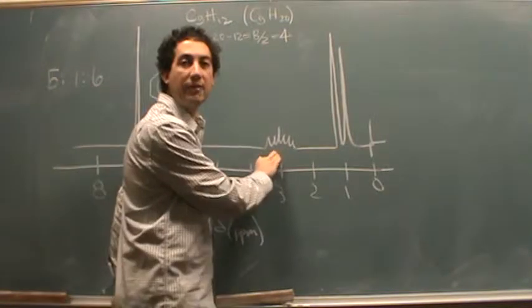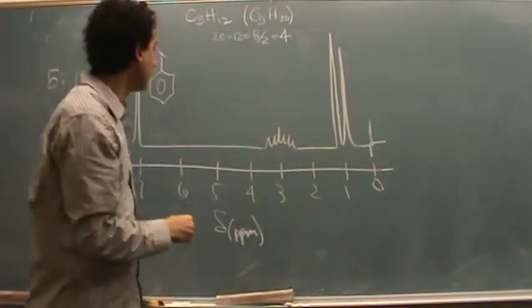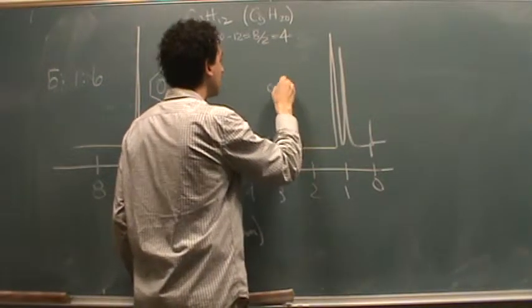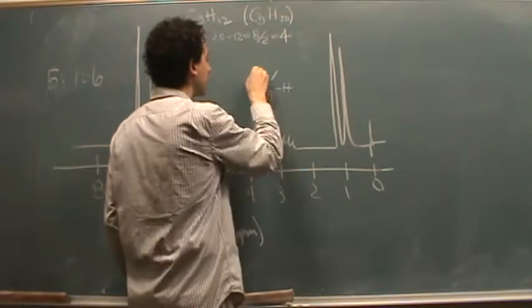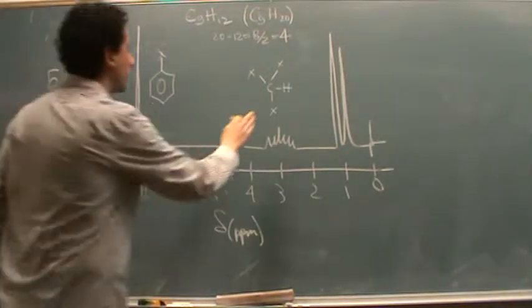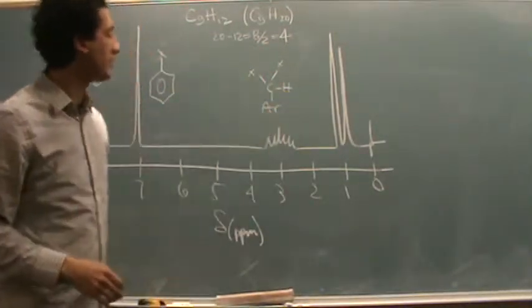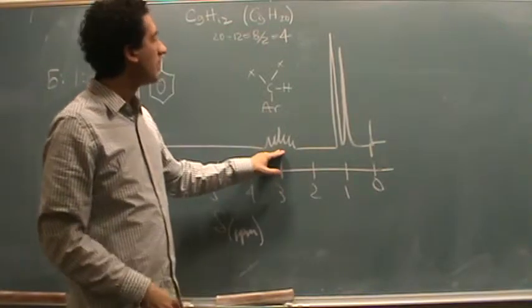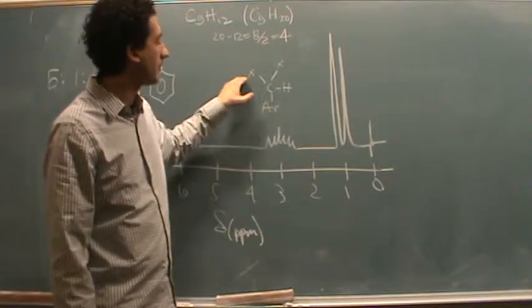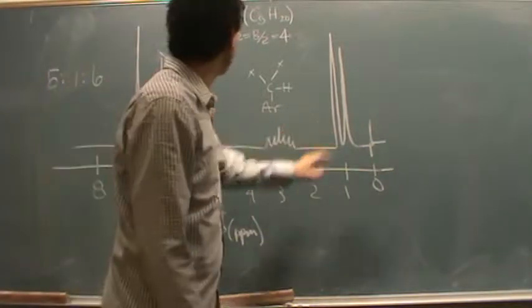Most likely this is whatever is closest to the aromatic, or bonded directly to it, and this is a normal alkane. So this has an integration of 1. I'm thinking this is a CH group bonded to 3 things. So one of these probably is the aromatic, and then I have 2 mystery things here, and then one of them is the H. And it's given a multiplet. It is close to aromatic, but probably most importantly, there's some sort of carbon groups with hydrogens on here that's causing the multiplet. Okay, finally, let's go over to the doublet.